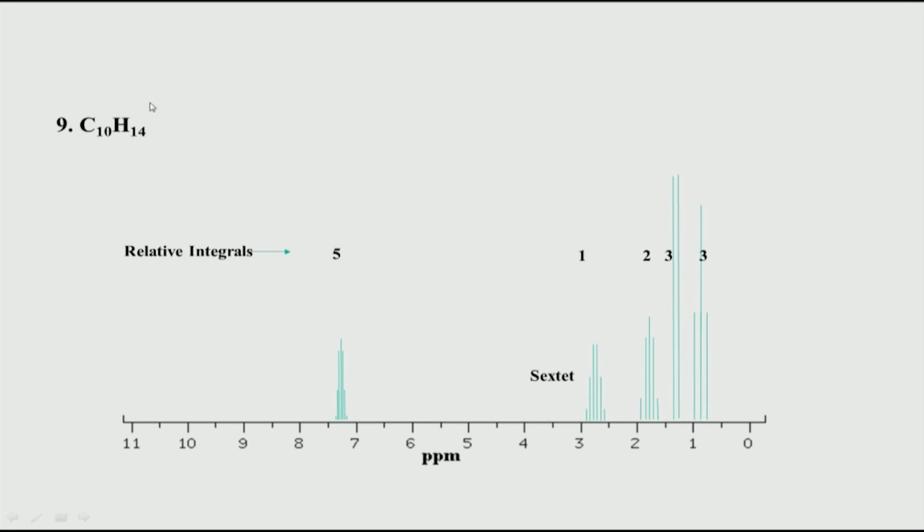Remember, in chemistry there are rules which can tell you whether there is an aromatic system. We use what is known as the index of hydrogen deficiency, which we will not go into in this course, or you can use what is called the rule of 13. These are the rules which chemists typically use to figure out the number of pi bonds, that is the degree of unsaturation and so on. So, that is one way to find out if there is an aromatic benzene ring present.